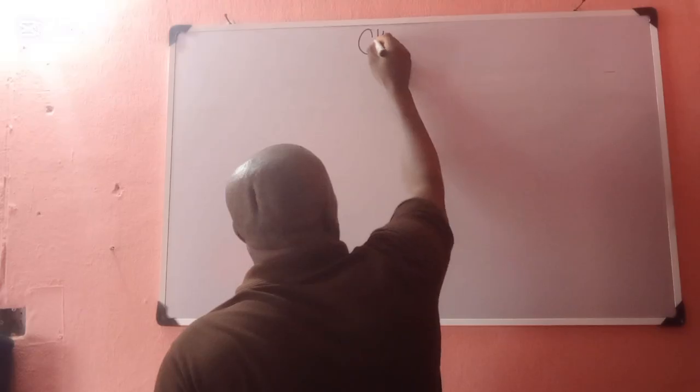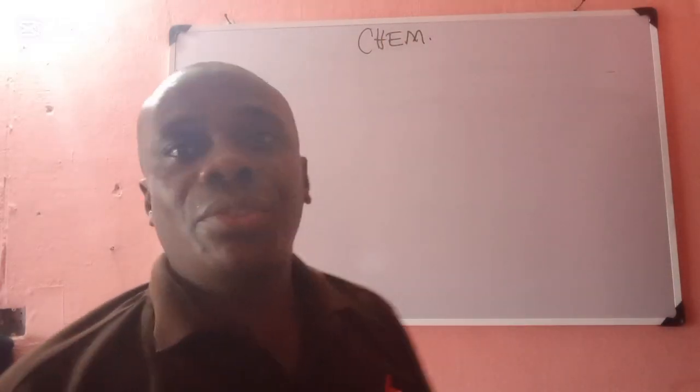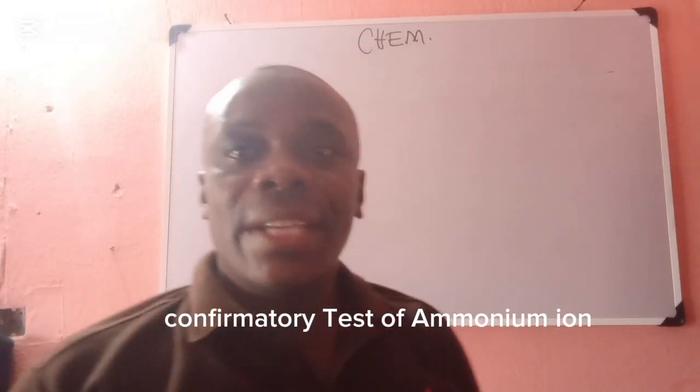Today we are going to look at chemistry. The topic we are going to look at is confirmatory tests of ammonium ions.